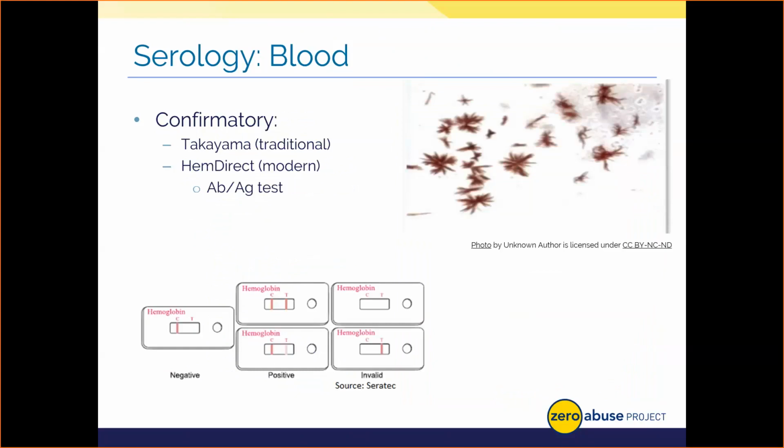So there's a couple of potential pathways to confirm the presence of blood to make note of that you might see your laboratories utilize. Traditionally, we've used crystalline tests called the Takayama test. A positive result manifests when we see these red crystals up in the top right of your screen, known as hemochromogen crystals that develop from a sample. To perform the test, we take a small amount of stain, place it on a microscope slide, throw on a cover slip, a little glass lid, if you will, on top of it. Then we add the Takayama chemical under it. Now, the pyridine chemical in the Takayama reagent, in the presence of heme and with a little bit of gentle heating, we just put the slide on a hot plate for about 30 seconds, will cause a chemical reaction where, if blood's present, you'll get those red-colored crystals.